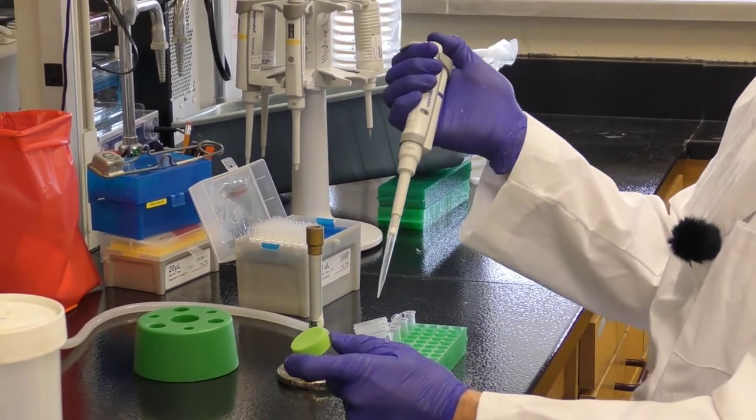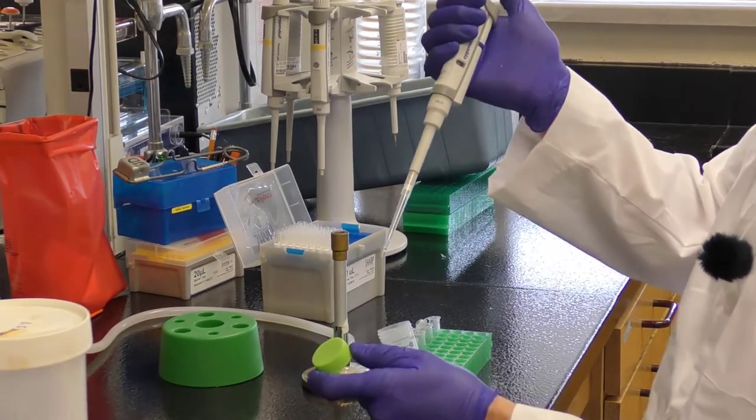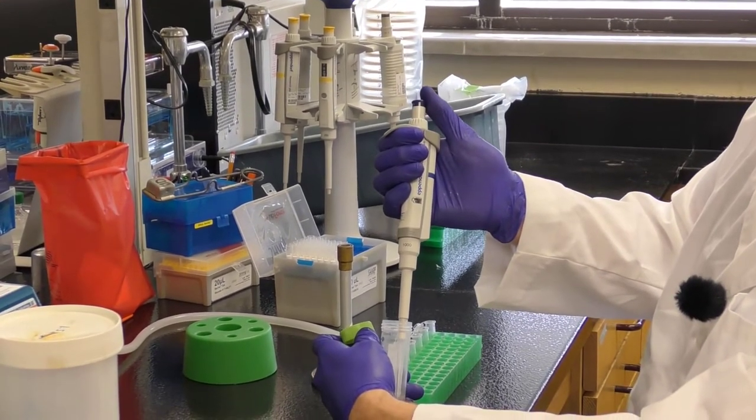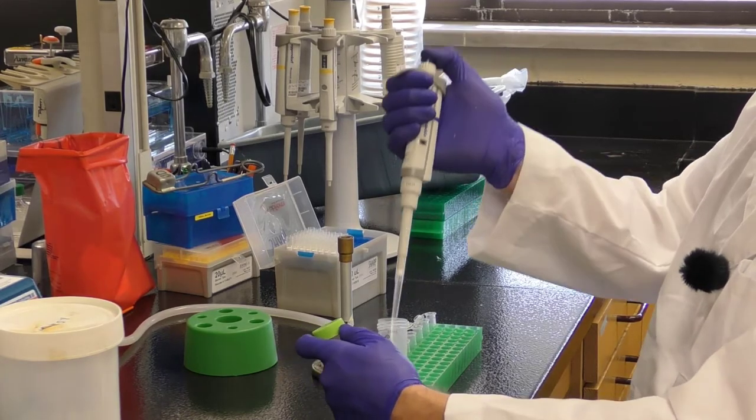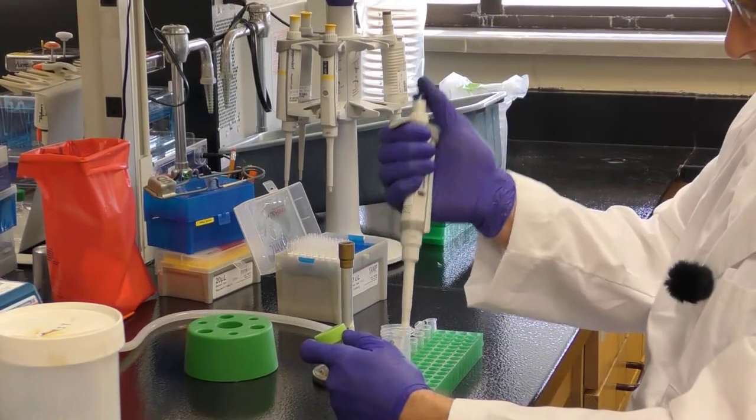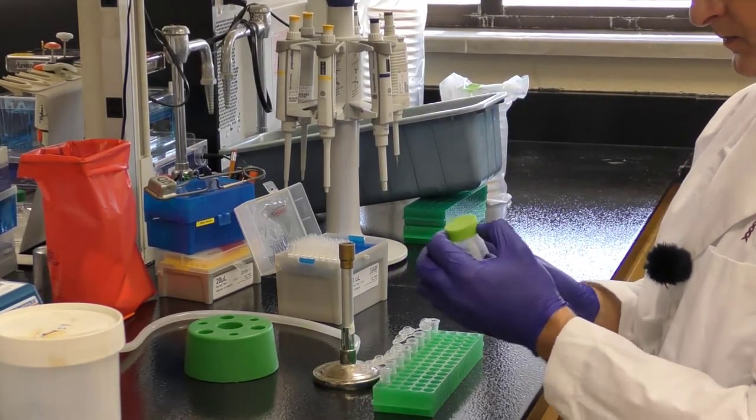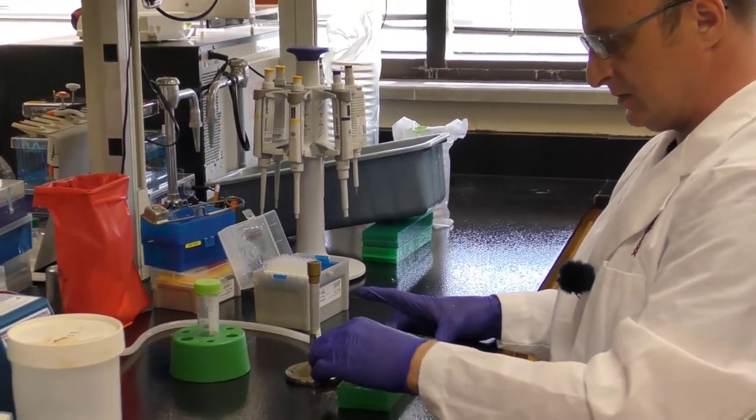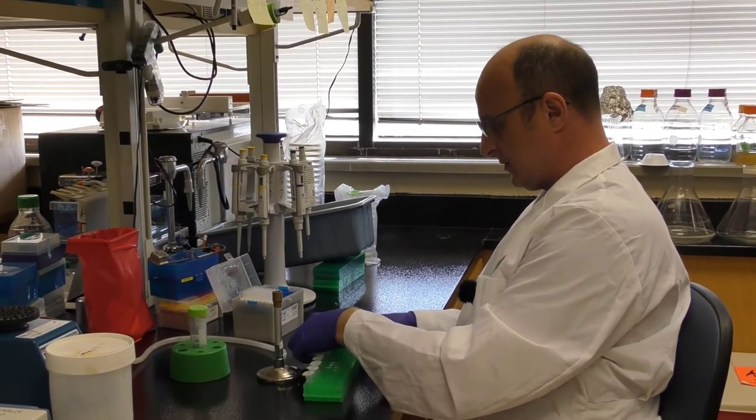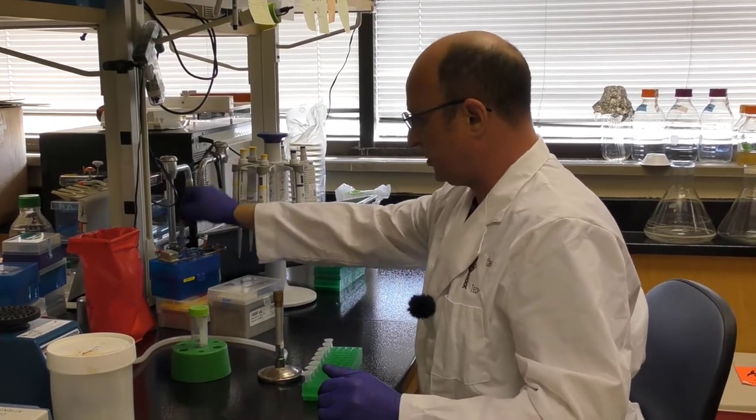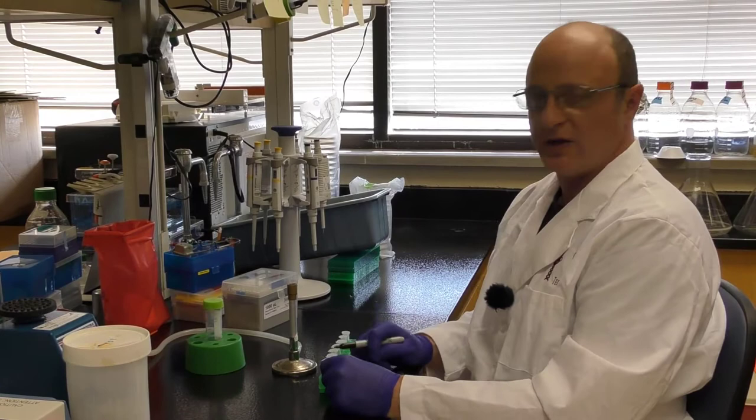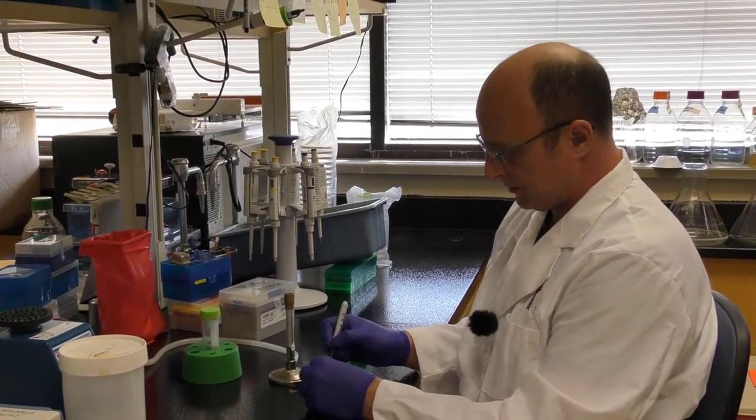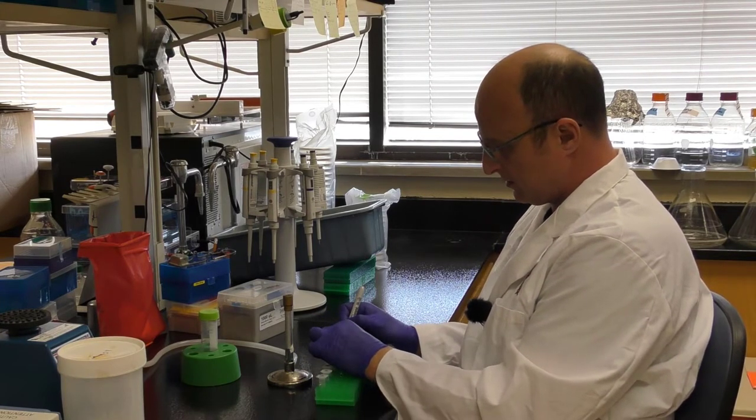An alternative method which is very handy when you're doing multiple of the exact same aliquot is to push completely through to the bottom shoulder, pull up that excess volume and then each time I will just push down to the first shoulder, leaving that little bit of extra volume in the tip. Close all of the caps and then we'll label each tube. In this case I'm just going to label with the dilution, minus one through minus eight. And that's it, our aliquots are now ready to carry out our serial dilutions.